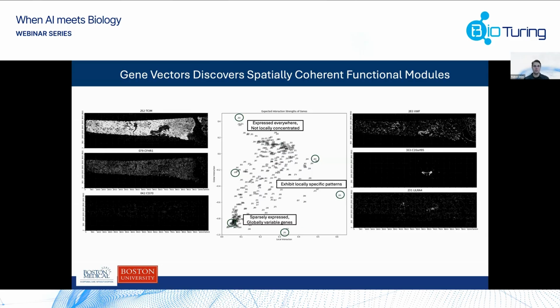It does support multi-sample representation and identifying. What we don't really have built out completely is differential expression. We have differential expression analysis, but for example, if you identify modules or interactions or niches or any spatial programs, we don't really have the statistical tools right now to do cross-sample comparisons. We are working on that because we have that in our own data sets, and we are implementing that, hopefully in the next weeks, if not months. But we don't have that for everything yet.